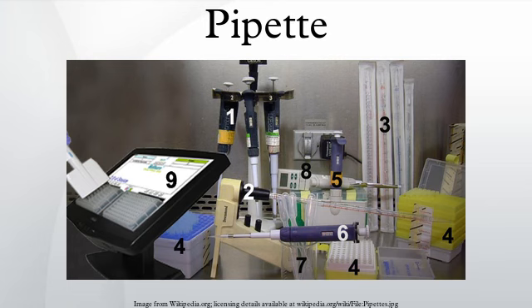Manufacturer: irrespective of brand or expense of the pipette, every micropipette manufacturer recommends checking the calibration at least every 6 months, if used regularly. Companies in the drug or food industries are required to calibrate their pipettes quarterly. Schools which are conducting chemistry classes can do this process annually. Those studying forensics and research where a great deal of testing is commonplace will perform monthly calibrations.